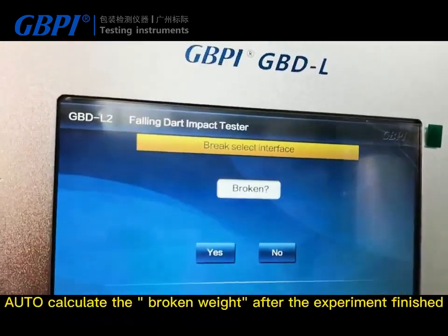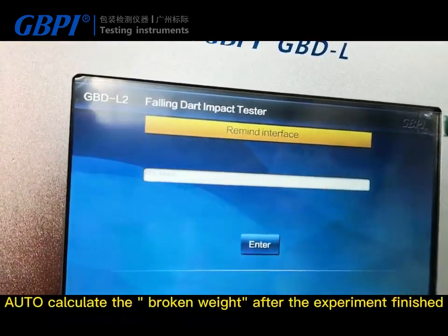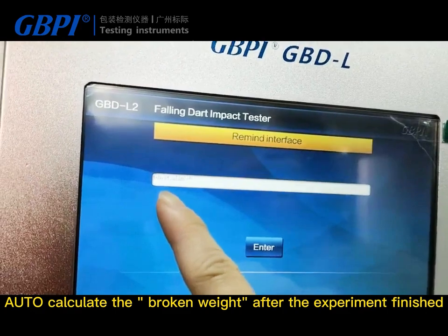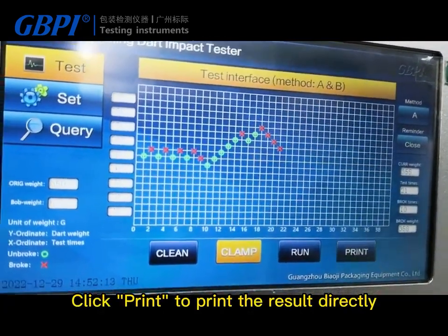The number of breaks must reach 10 times; otherwise the experiment is considered failed for Methods A and B. After the experiment is finished, the system automatically calculates the break weight. Click Print to print the results directly.